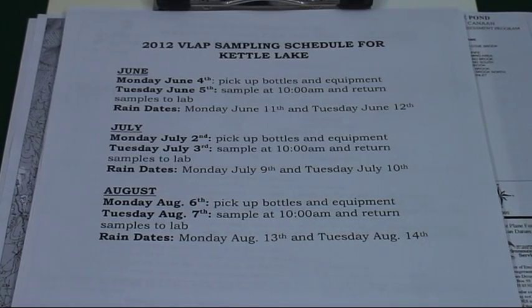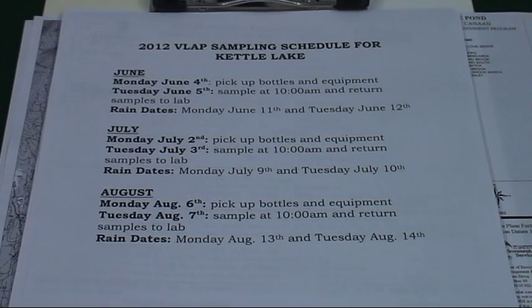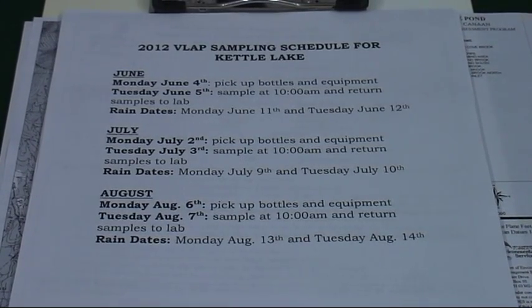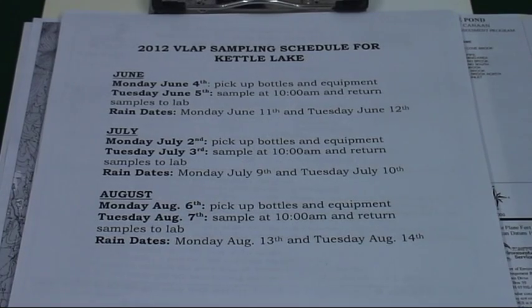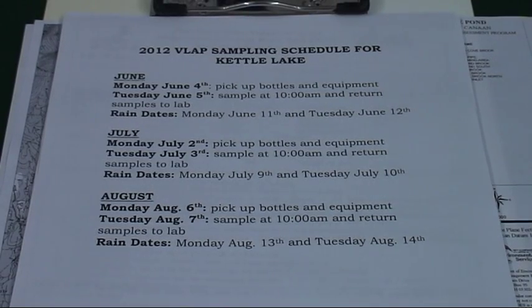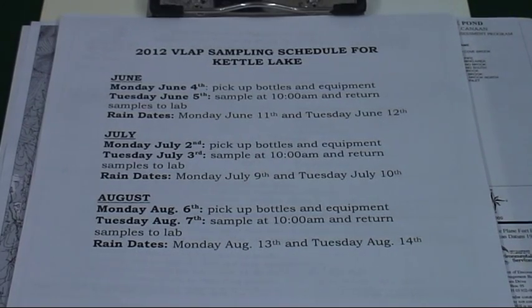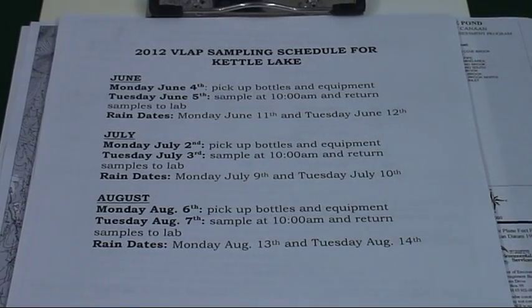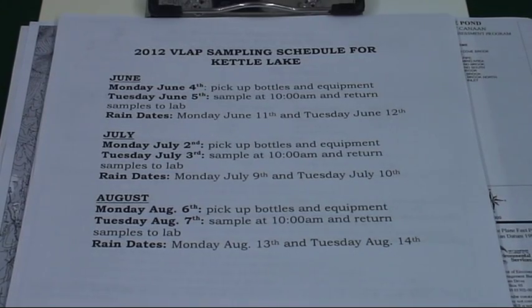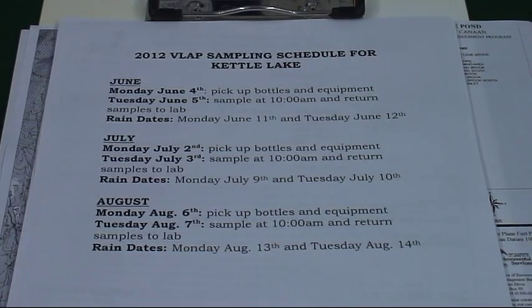The first thing we recommend is drafting a monthly schedule that would include proposed sampling dates and alternate dates if the weather or other events impede. We recommend sampling once per month in June, July, and August. You may sample more or less frequently as desired. Please consult with the VLAP coordinator or your satellite laboratory manager about your proposed schedule. This will allow us to reserve equipment for you and to staff the laboratories accordingly, and also allow you to coordinate with fellow volunteers and lake residents. You may even recruit some new volunteers.